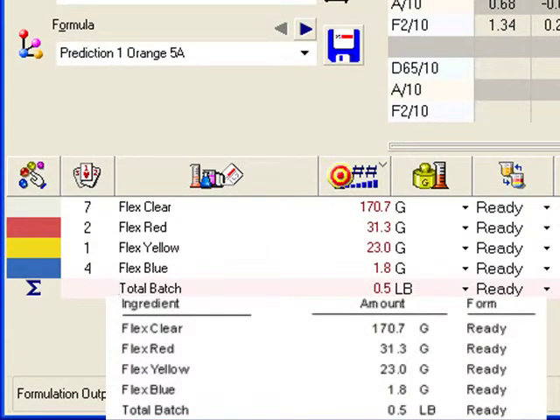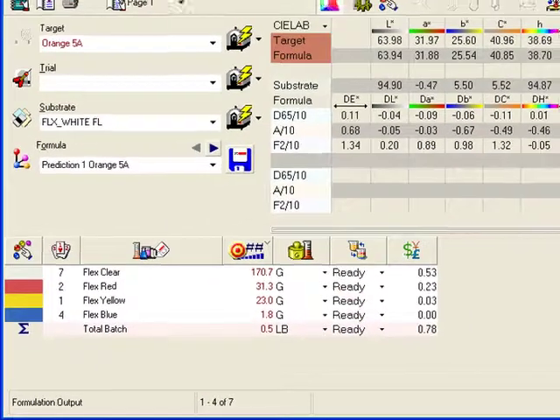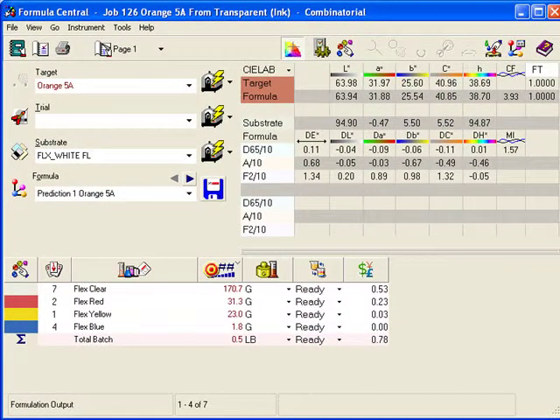Now, let's have a look at the matching tools. I'll show you the tools Search, Search and Correct, and Combinatorial individually. Then I'll show you how they're related to Auto-Formulate. Along the way, we'll see how we can use constraints in the grid to limit our results.